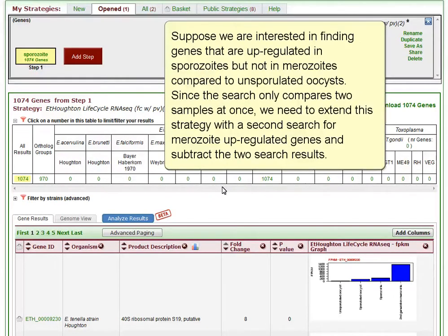The search returned 1,074 genes whose expression increased eight-fold or greater from unsporulated oocysts to sporozoites. Suppose we are interested in finding genes that are upregulated in sporozoites but not in merozoites compared to unsporulated oocysts. Since the search only compares two samples at once, we need to extend this strategy with a second search for merozoite upregulated genes and subtract the two search results.